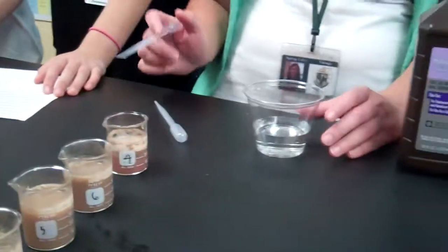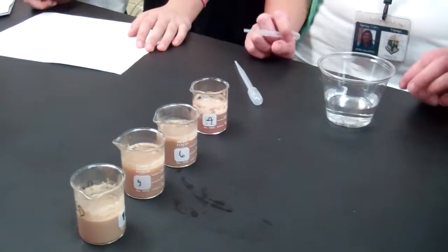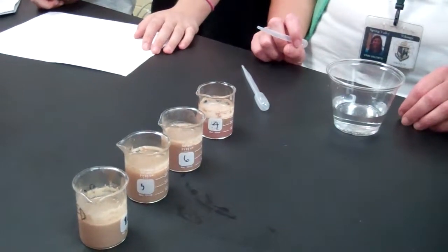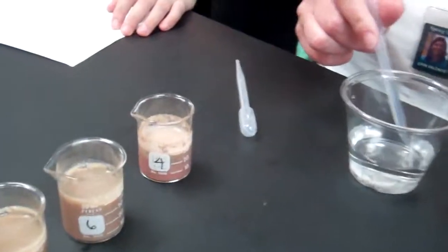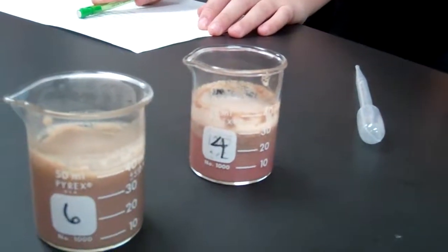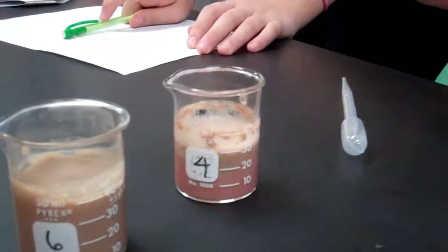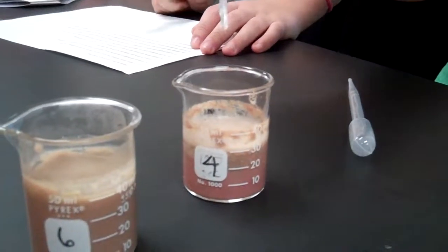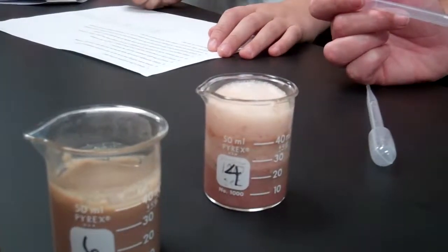Okay, before I start, any guesses on what will happen when I pour hydrogen peroxide onto the raw? Decompose. It's going to explode. It's going to dissolve. Break it down. You think it's going to bubble? Bubble? Yeah. Alright, so are you guys ready? Here we go. Ooh. Oh.